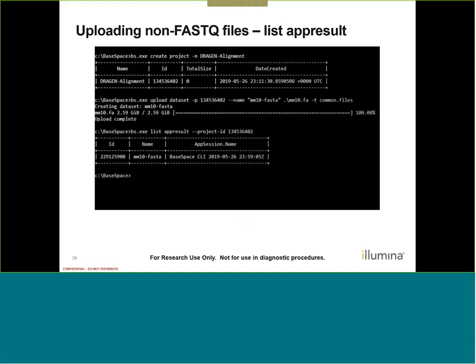Now we need this ID. This ID is specific to the app session, not the file we uploaded. So it's possible to upload multiple files into an app result, they will be contained within the same app result, but they will all have unique file IDs. So one more step is required to grab that file ID, which we're going to need when we go into the next step. And that's the content command.